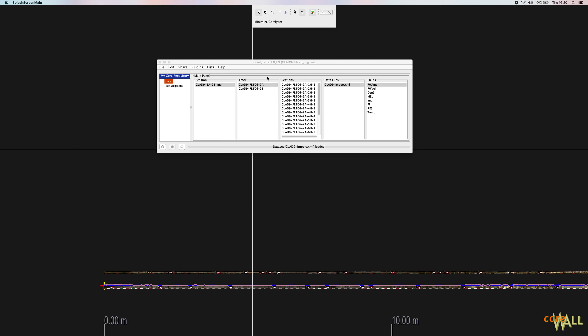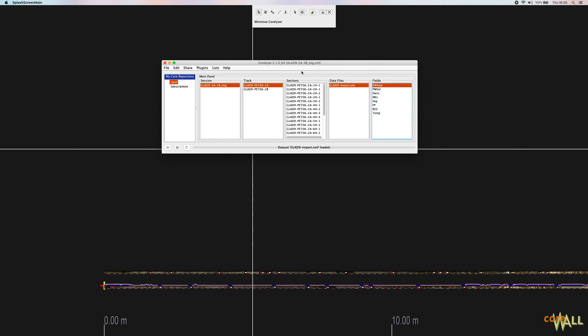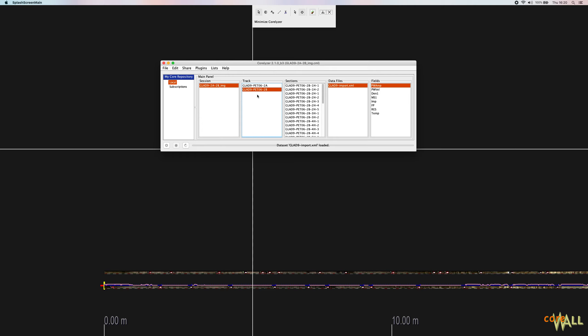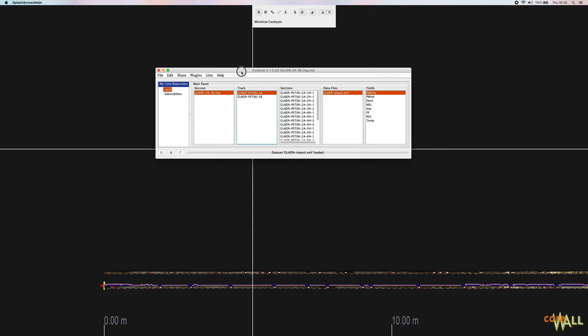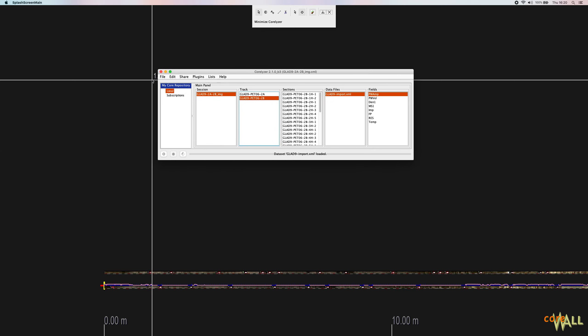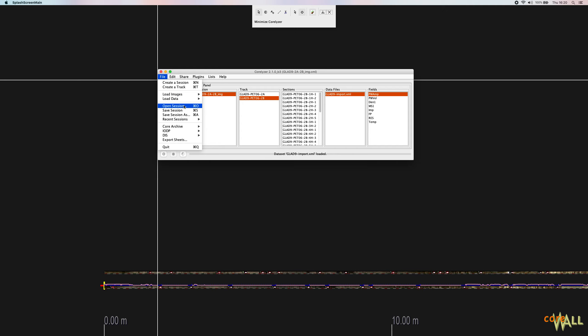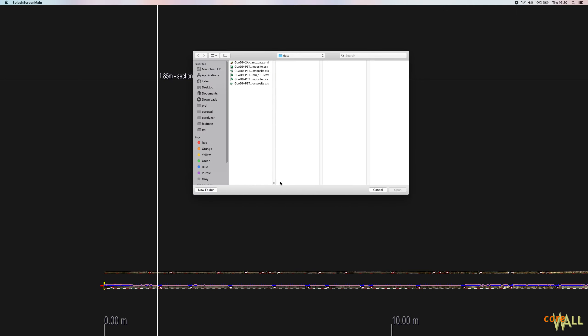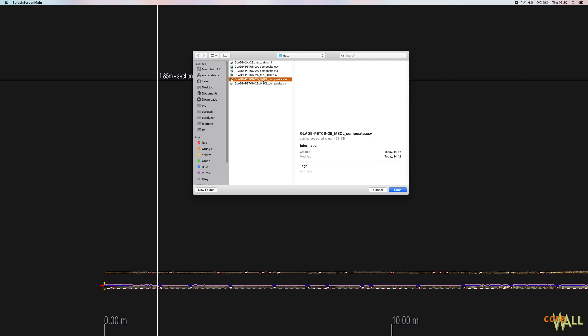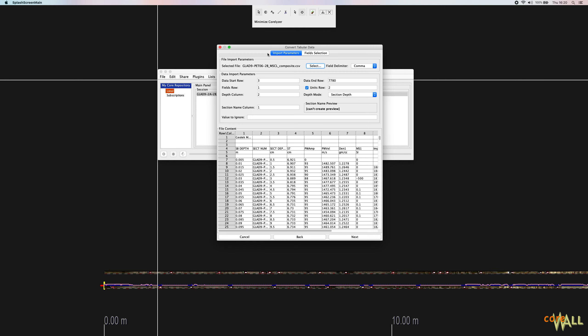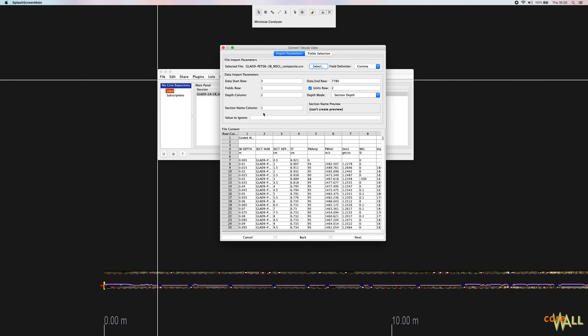Now I'm going to quickly go through the same process and import my data for hole 2B. You don't have to have your data in separate holes. You could have data for all of your holes in a single file and do this once. But for purposes of this demonstration, I put them in separate files. So again, to start, we'll go to convert tabular data to XML. I'm going to choose my 2B data file, CSV file.